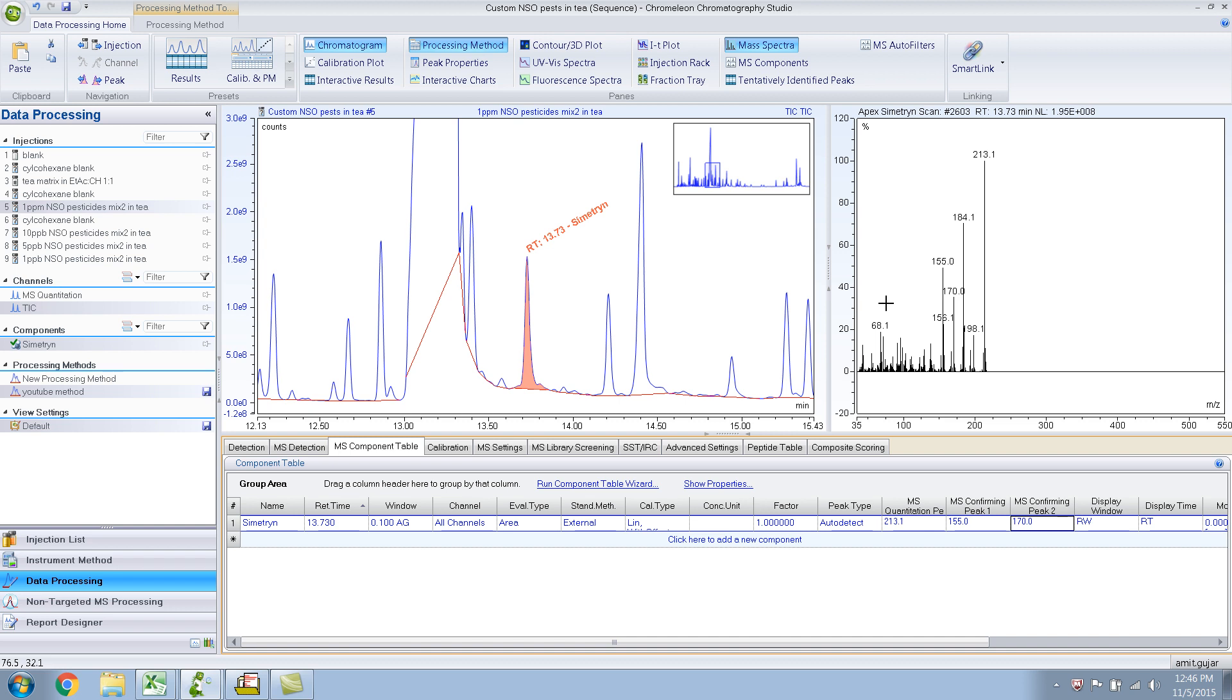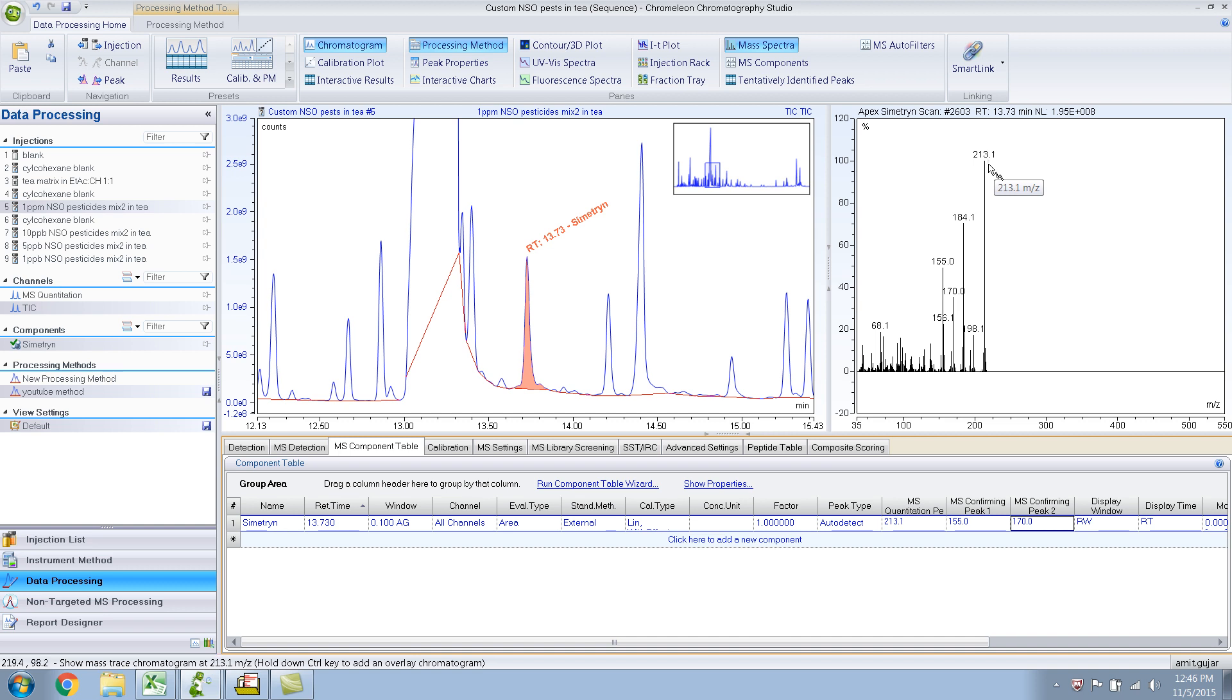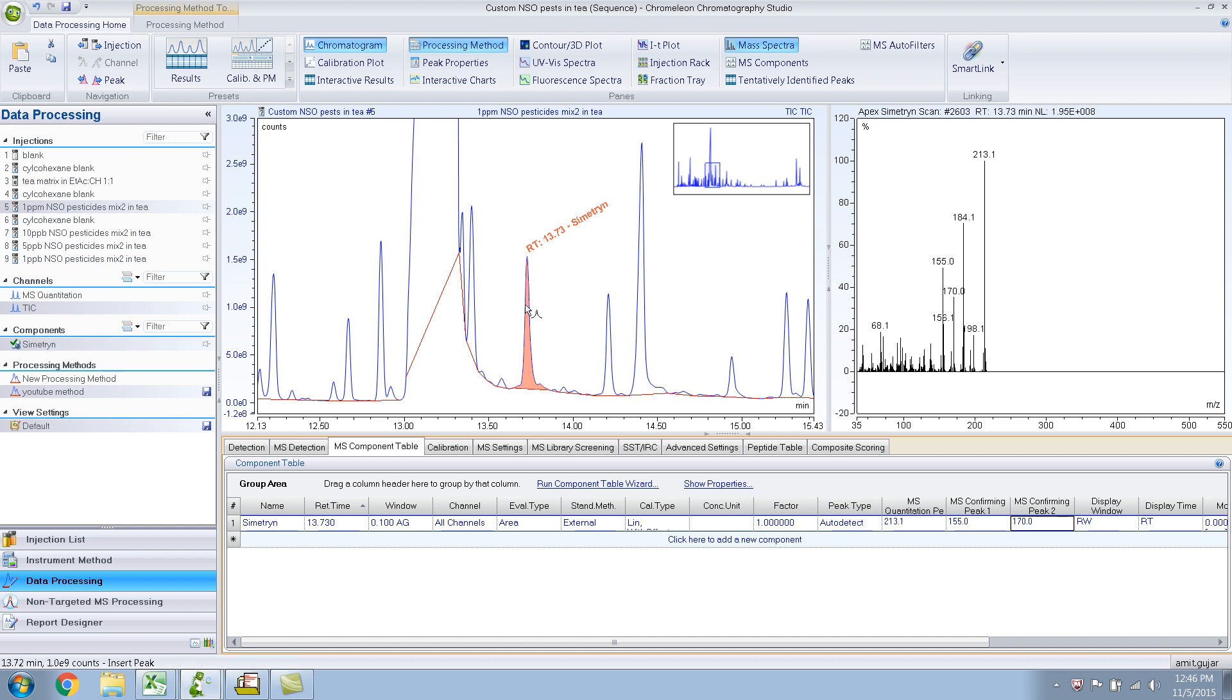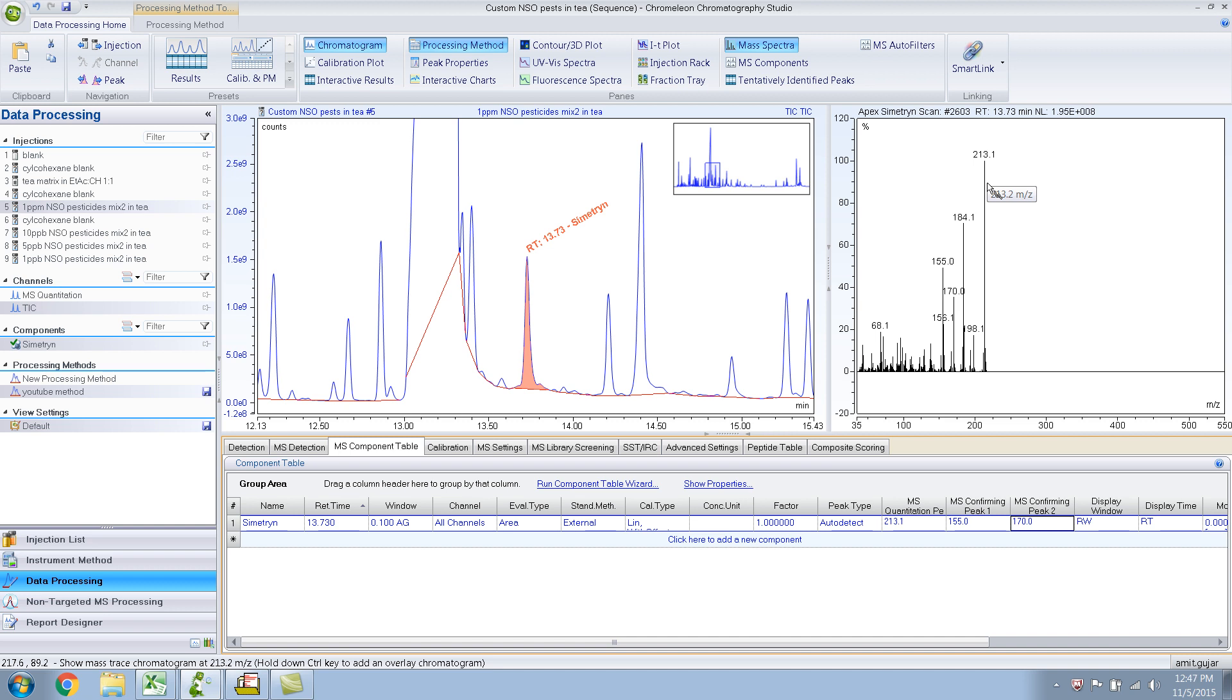This shows the importance of why we need to quantitate on a unique mass spectral peak which is unique to symmetry. So 213 is unique to symmetry, and there's a good chance that if there is any coelution at this point, it's probably not going to be 213. If it is 213 then we can't do anything about it - you would need something more selective like triple quad. This is a full scan spectra.